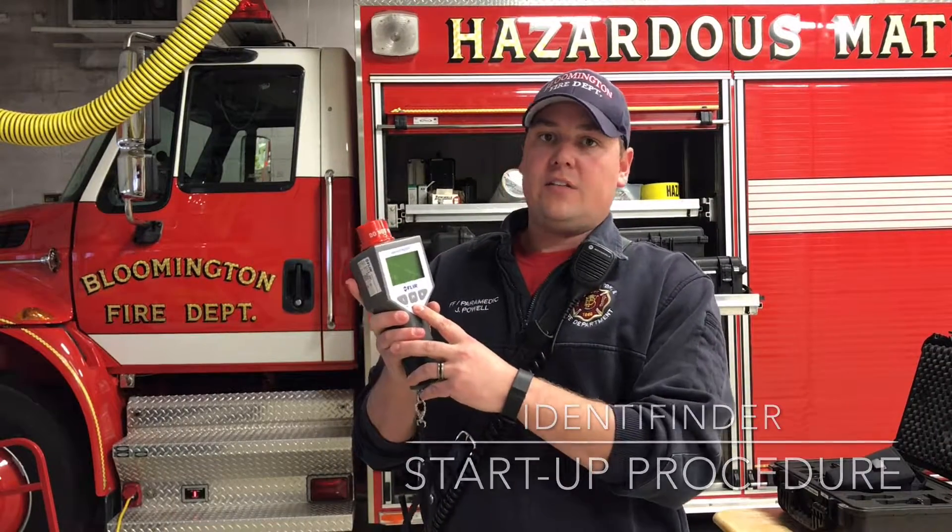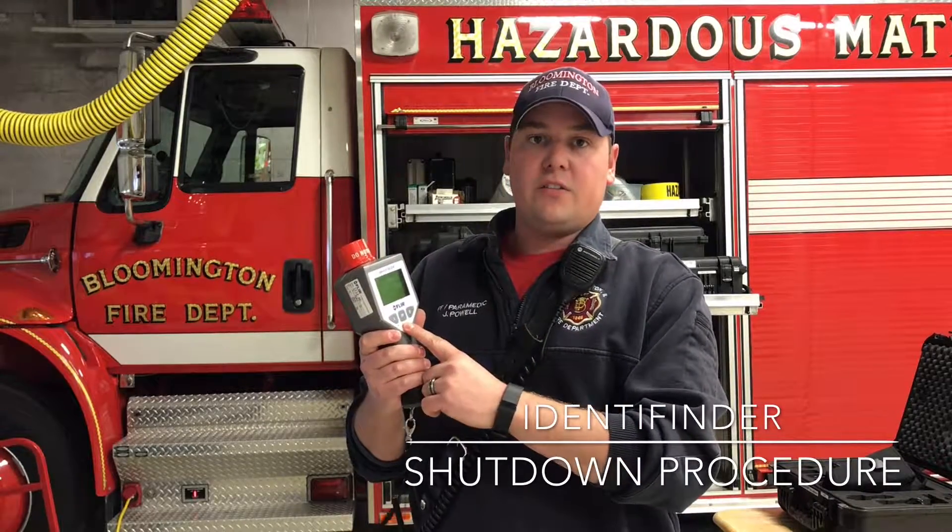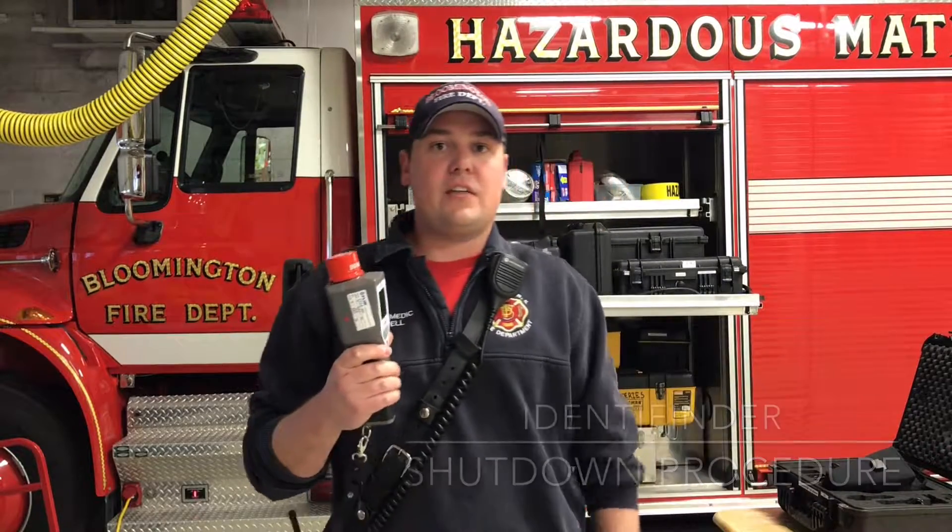The identifinder can be turned on by the power button — hold it down until it boots up. To shut down the monitor, it's the same sequence: hold down the power button until the screen shuts off, then store it safely in its case.